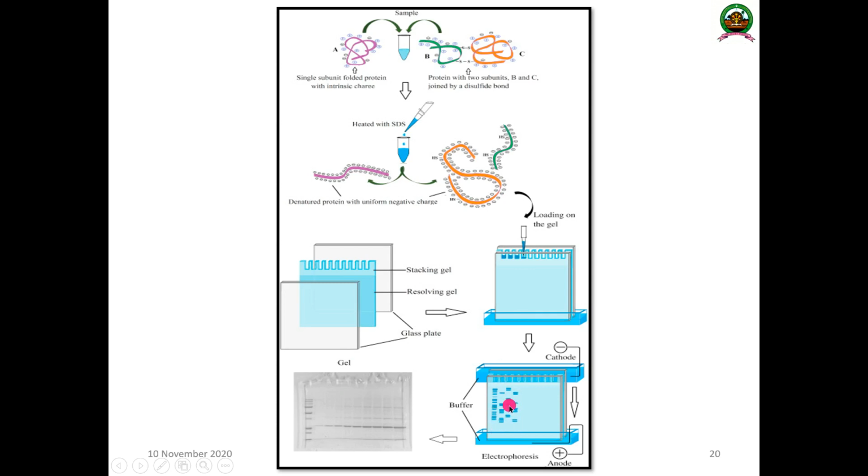So this you will have, and you can stain with Coomassie brilliant blue, and you will get it like this, or silver stain. If you stain with silver stain, it will not look light blue; you will have the dark color. Like this you will be able to see. Once this is done, the proteins can be identified. This is the gel. So this is the overall process of electrophoresis, especially sodium dodecyl sulfate polyacrylamide gel electrophoresis, or SDS-PAGE.